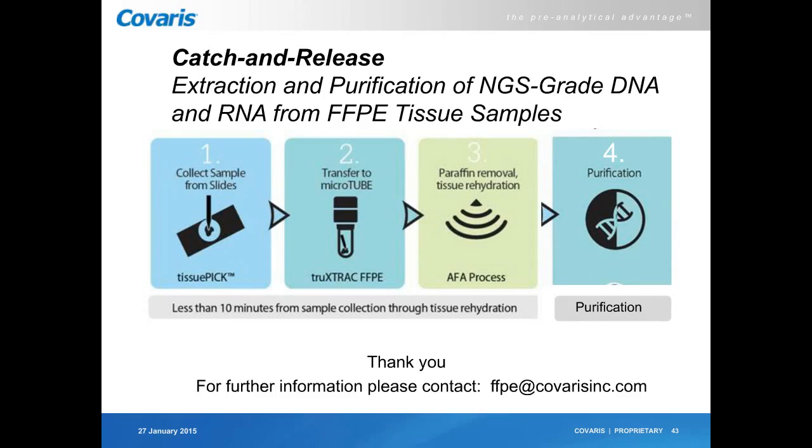It will depend, of course, on the tissue type. Do we have many nuclei or not so many nuclei? So I can't really give a black or white answer. It will depend, and also, of course, on the storage condition of the slide, because when slides are stored too long, you can start to see some degradation, especially for RNA.